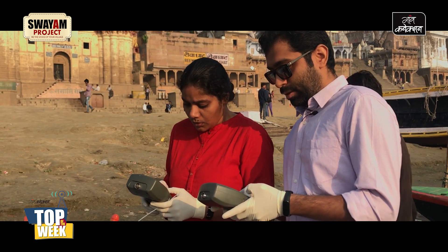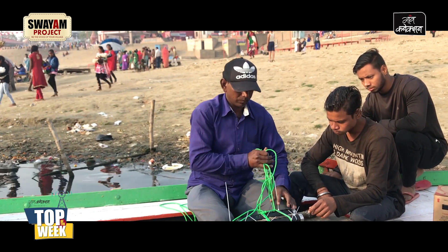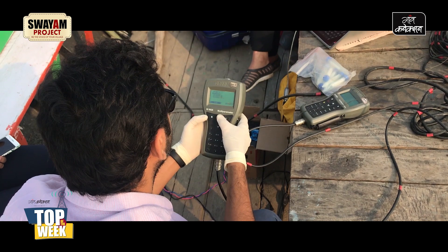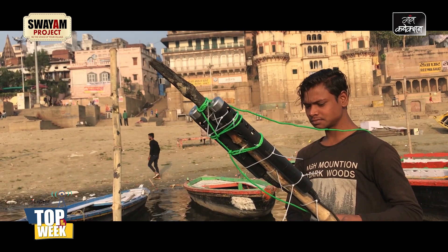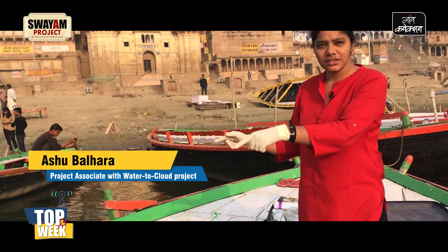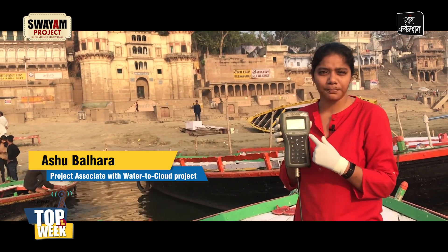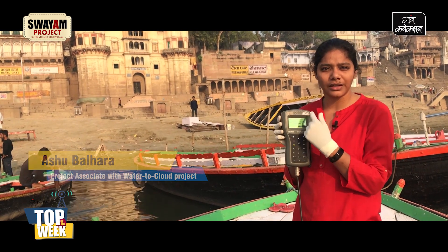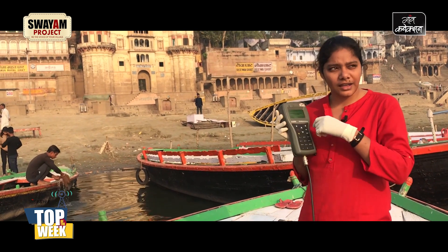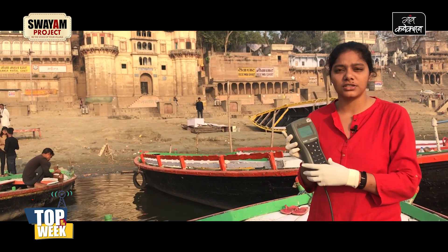As soon as we come onto the boat, we first initially take out our sensors for a quick calibration, then we put the log entries for the particular day and time. Then we have our sensors attached to the boat. After attaching them, we switch on the meters and basically press the key, so the meter starts recording and starts showing the readings. As we move, the values keep on changing.